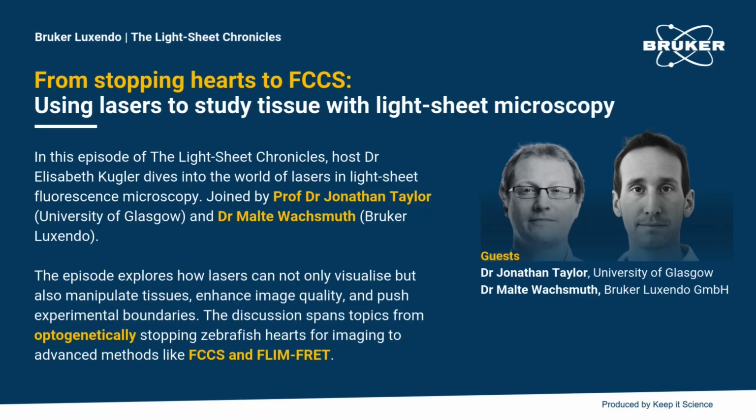And when they do not bind, then they basically show independent fluctuations. So when you determine a cross correlation of these two intensity traces in your two spectral channels, you can determine the amount of interaction. And especially with knowledge about the concentration, you can also determine things like a dissociation constant. So really quantitative biochemical parameters.